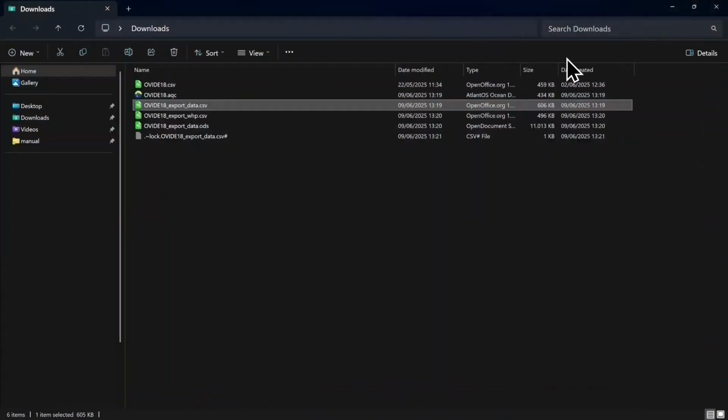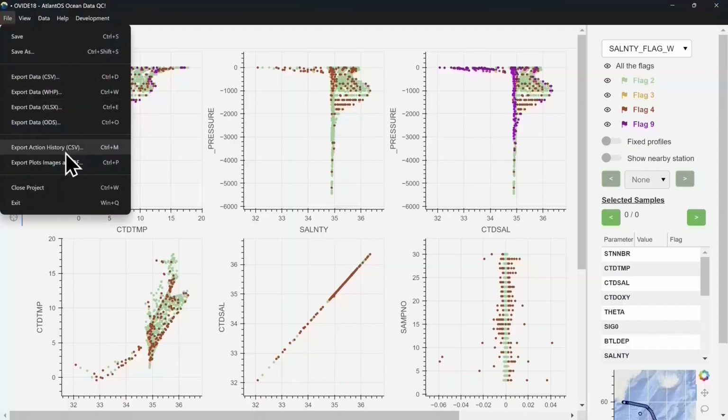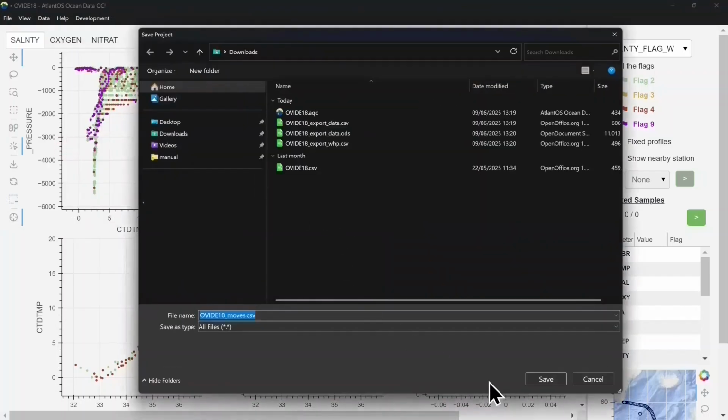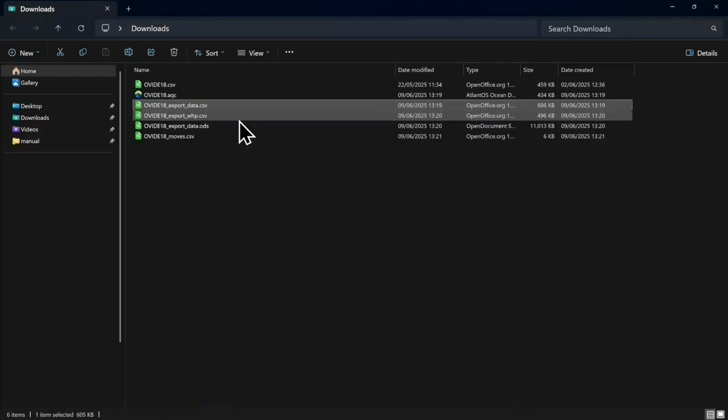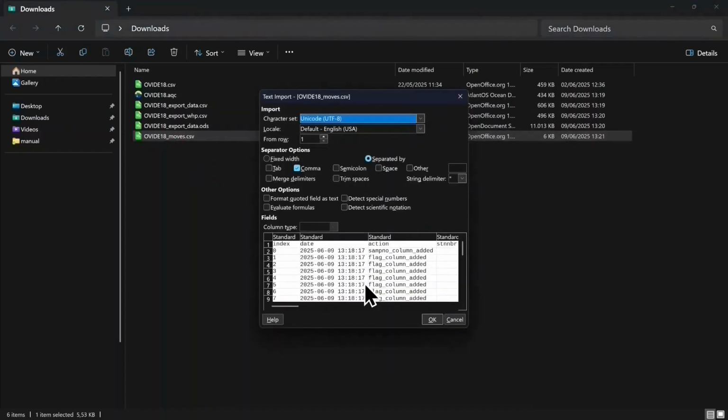The action history can also be exported. It will be useful to track the change, like the date, the type of action, the flag parameter updated, and the required fields to locate that parameter. It will also come with a human-readable description.